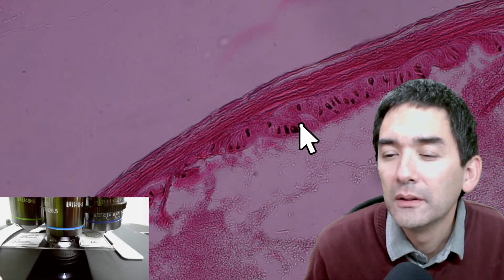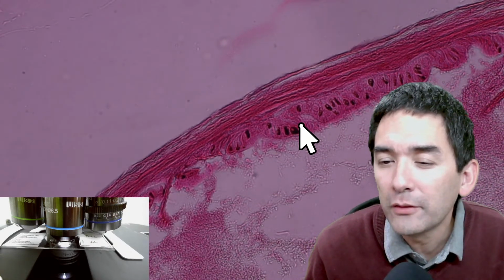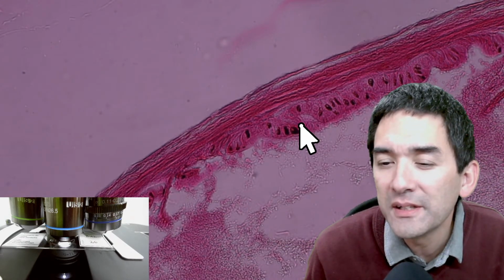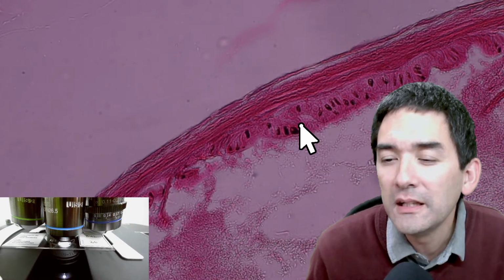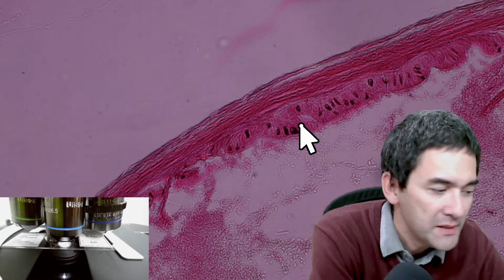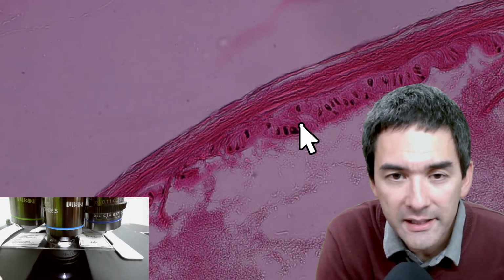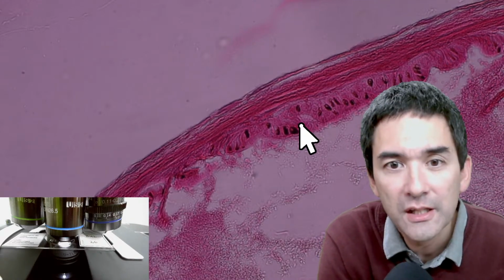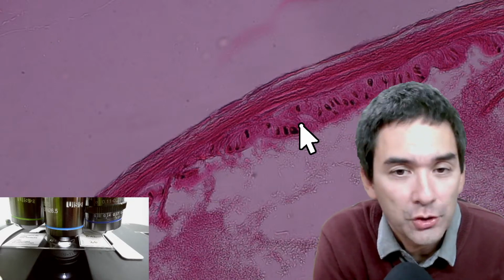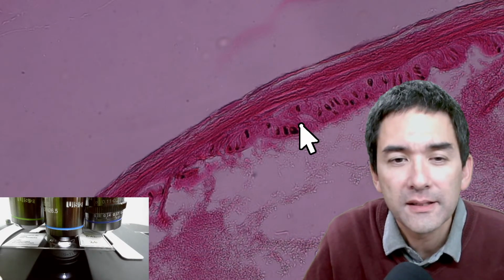It is fairly easy, under quotation marks, to use a microtome to create thin sections from a plant. How would you go about creating a slide from, say, meat from a butcher? Is that even possible for an amateur? I can tell you a little bit about this. So basically, how do you make permanent slides and cross sections from animal tissue? Okay, so that's the question.